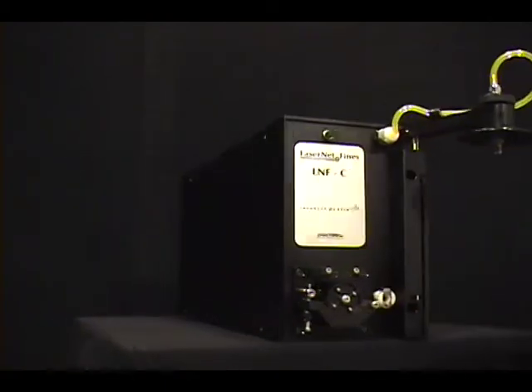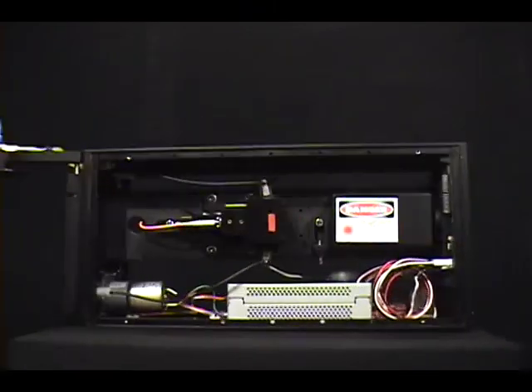Using laser imaging techniques and advanced image processing software, the LNF not only counts particles with industry-leading accuracy, but also classifies the wear debris in the sample, making it possible to predict different types of machine failure.